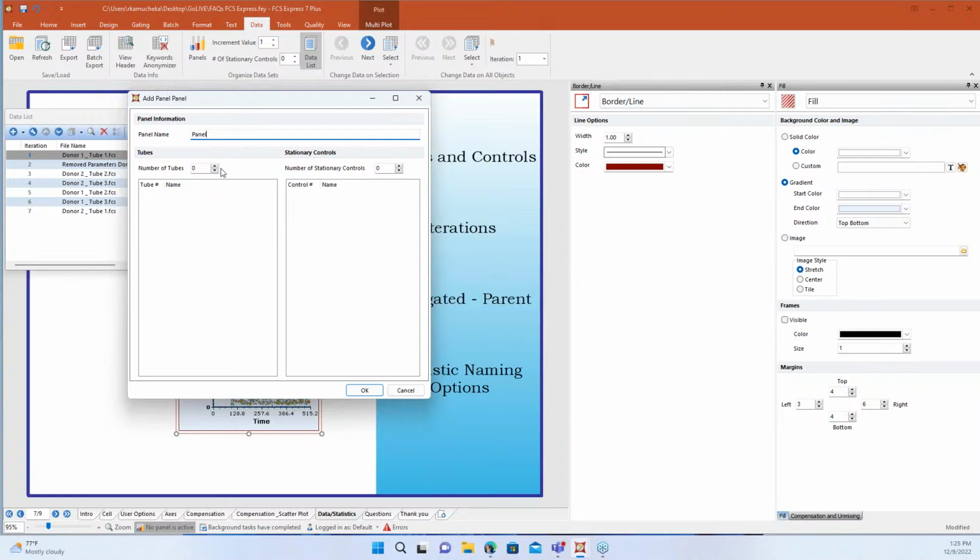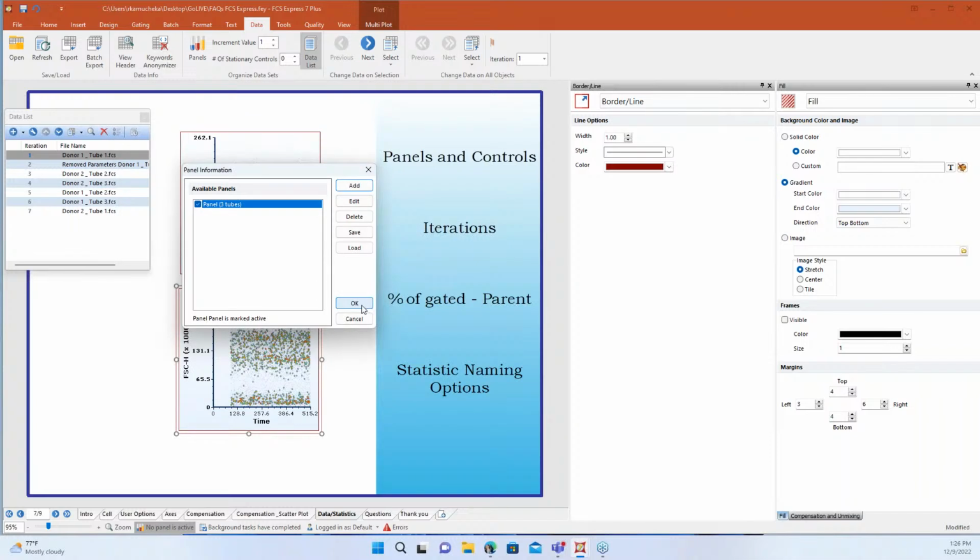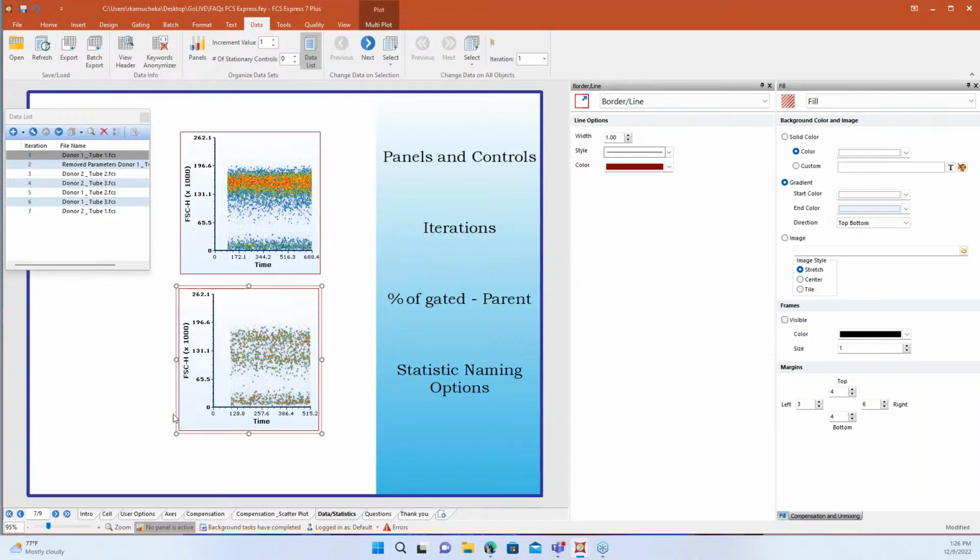You can introduce this information however you'd like. Once you have it in there, you have the ability to name it. So if I wanted to do T cells, B cells, NK cells, I can write in that information, and I'll know which order my data goes in. I can do the same with my stationary controls. I can add some stationary controls here. I can say FMO for CD4, or some population that's giving me a headache, or whatever other kind of controls that I have. Maybe it's just a universal control, like a positive sample that I know, if it looks like this, I have a positive in my test sample. Whichever those are, you can introduce those and give them a name. And then when I click OK again, you'll see that my data list is good.